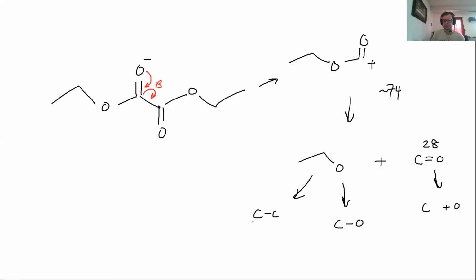So these are our main products. This guy could split off into carbons by itself, and so on. Depending on where the hydrogens go makes the most stable molecules. So right here, this would be our 29, based on we had 15 and 14. So we had 3 hydrogens there and 2 hydrogens there.